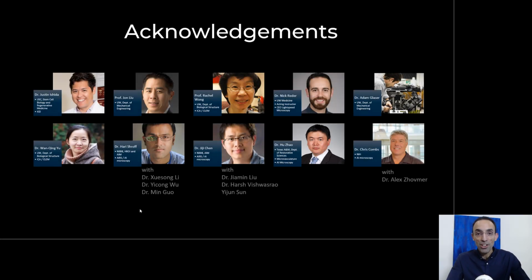Okay. Thank you, Sean. Thank you very much for those demonstrations. Really appreciate it. And I hope it was useful for everybody to see a little bit how Aivia can be used to do manual and automatic segmentation, including some proofreading of the results that were created automatically.